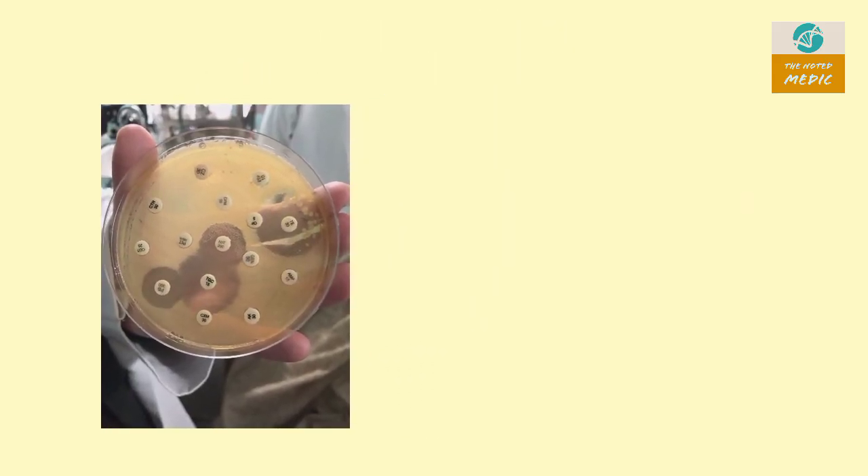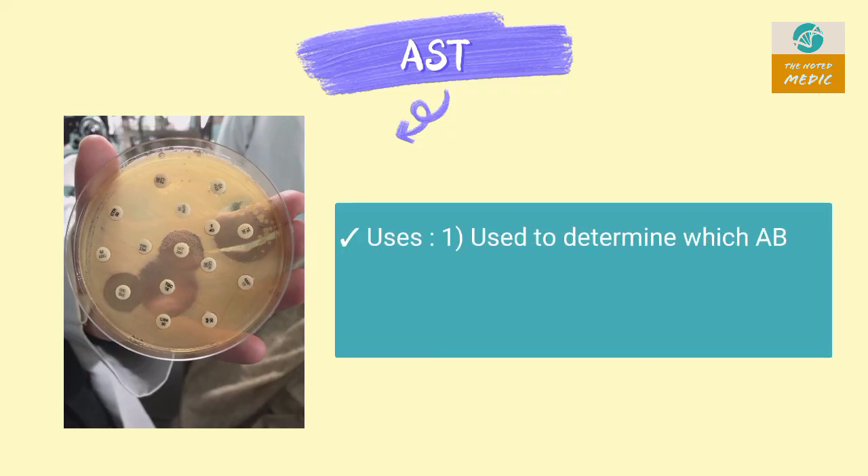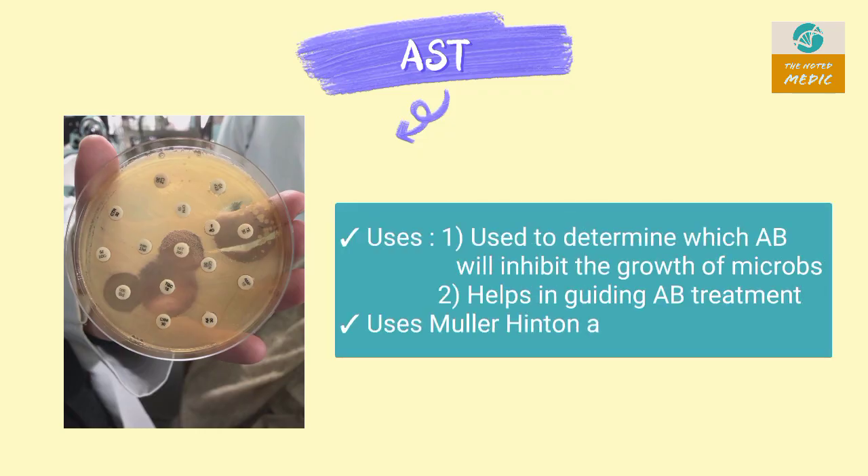This is an antibiotic susceptibility test (AST). It is used to determine which antibiotic will inhibit the growth of a microorganism. It helps in guiding antibiotic treatment and uses Mueller-Hinton agar.